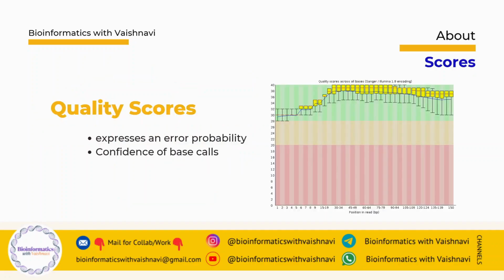Now let's quickly talk about quality score. Not every base call made by the machine is perfect. Quality score tells us how reliable each base is. The higher the score, the more confident the machine is about calling the base. And a lower score means more chances of error.